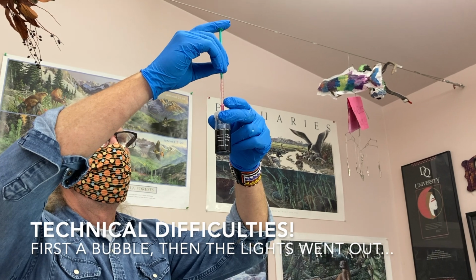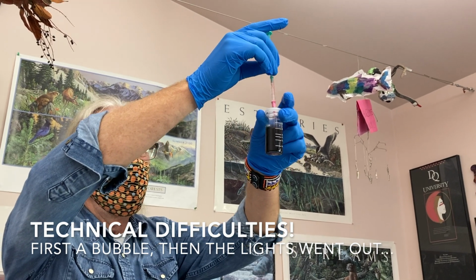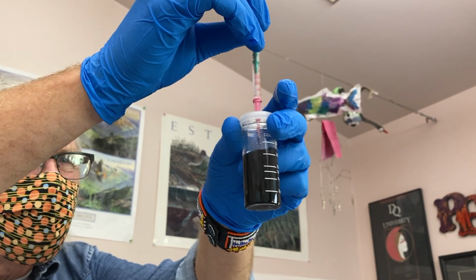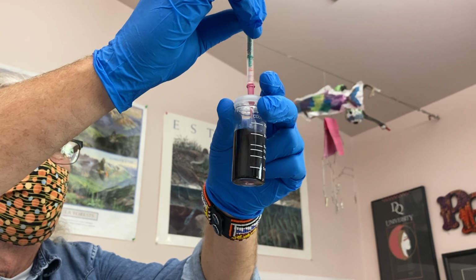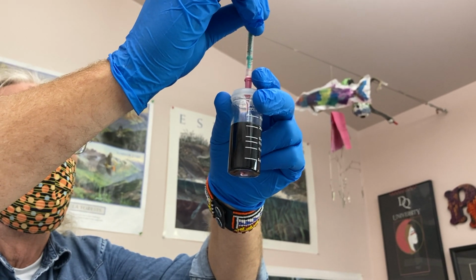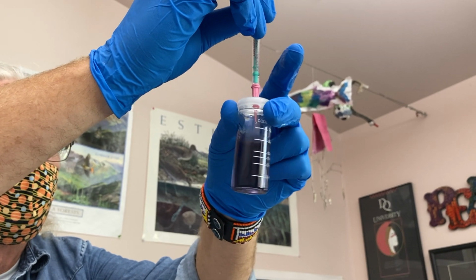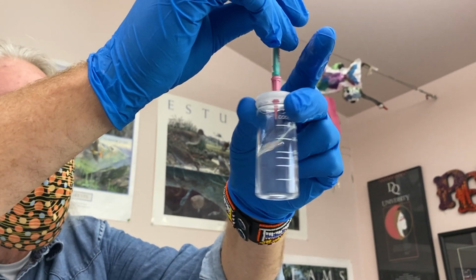Okay, I'm going to put in a couple of squirts, go 1 milligram, 2 milligrams, 3 milligrams, and then swish it around a little bit. It looks lighter, but not appreciably. There's 2 more milligrams. Getting a little lighter, still a ways to go. 6. 7. It's looking more purplish. A little lighter still. We might have to go beyond 10. Oh, there we go. That's 10, right on the nose.